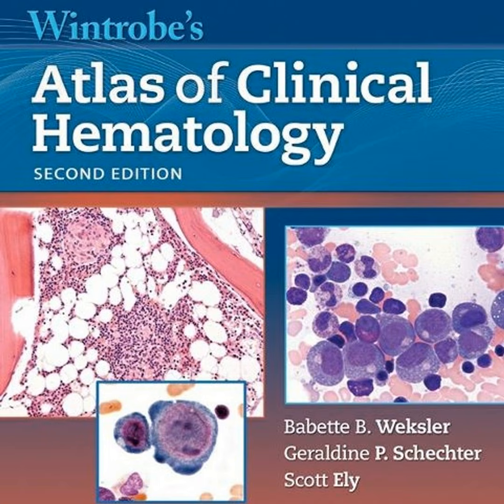That capability has huge implications. For instance, MFC is the gold standard for diagnosing chronic lymphocytic leukemia. Absolutely. And if we're looking at, say, a B-cell non-Hodgkin lymphoma, the whole diagnosis relies on identifying monotypism. Meaning what, exactly? Normal reactive B cells are polytypic. They express a mix of kappa and lambda light chains on their surface. A cancerous population is monotypic. It expresses only kappa or only lambda. That's the definition of B-cell clonality. It's the difference between a reactive lymph node and a lymphoma.